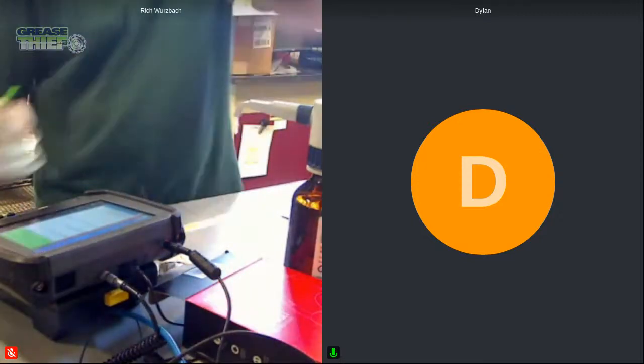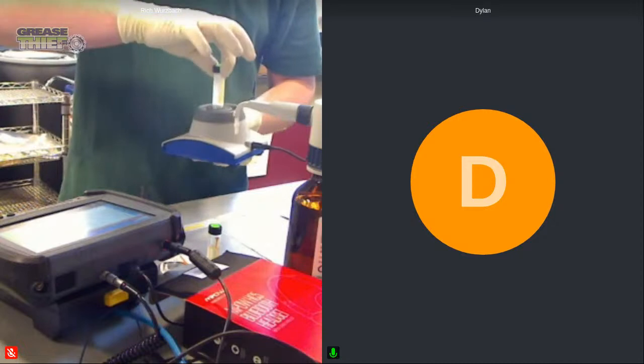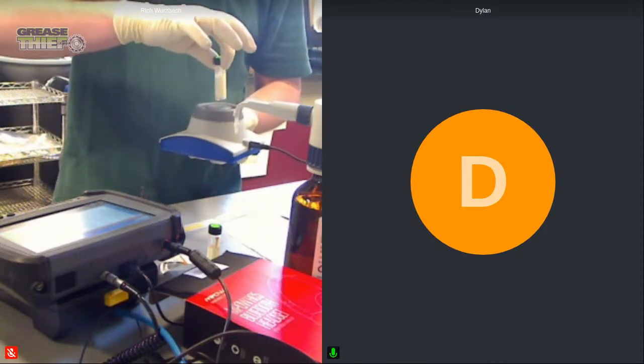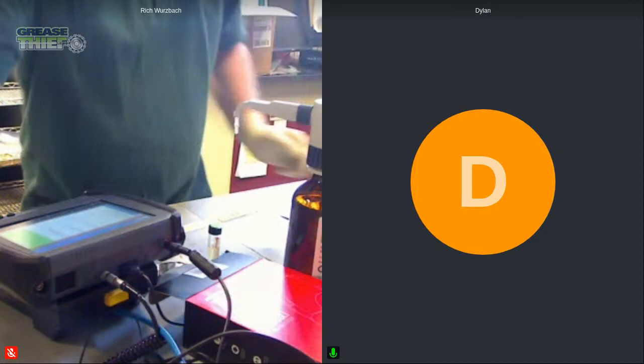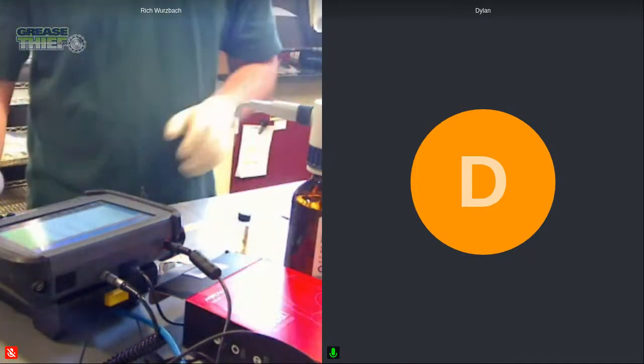And then I forgot to mention, once we prepare the grease too, we're going to want to shake up the vial because we see we have grease kind of sitting at the top. So we have our nice shaker here, and we're going to put it on there so that the solution covers all the grease sample before we start our period of 6 hours. And then over here is our ruler unit.